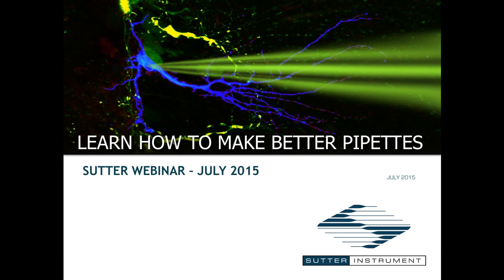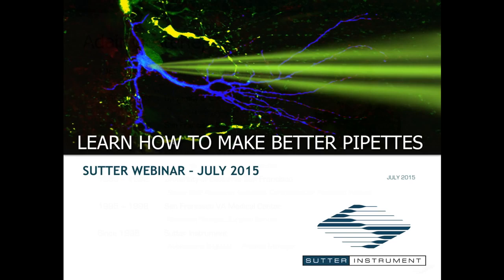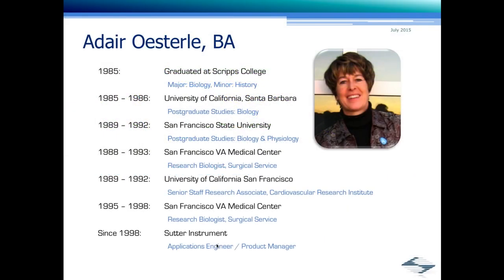And it only shows up there, and what happens is that platinum is just kind of sputtering out the metals, and it gets incorporated into the shoulder of the taper, but you don't see it at the tip. It gets incorporated into the glass. It's inert. It doesn't leach out. It doesn't poison your cells. It doesn't cause any problems, and it's really something you can pretty much ignore, and it's not an issue.